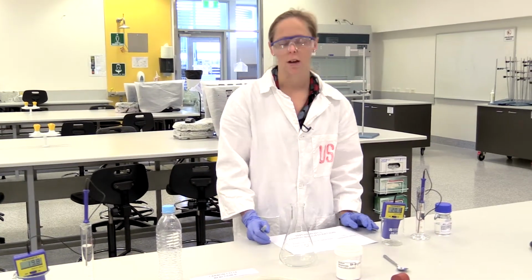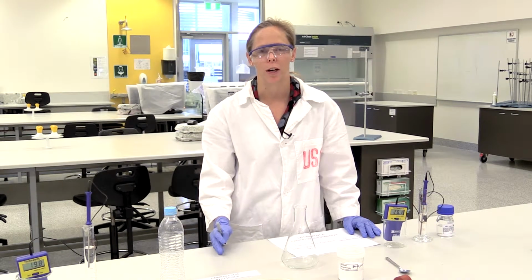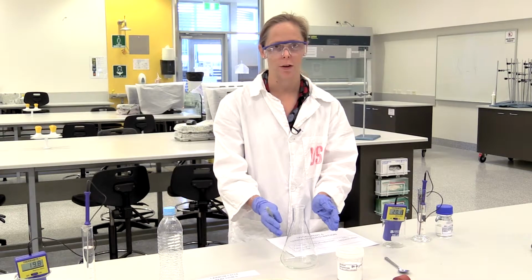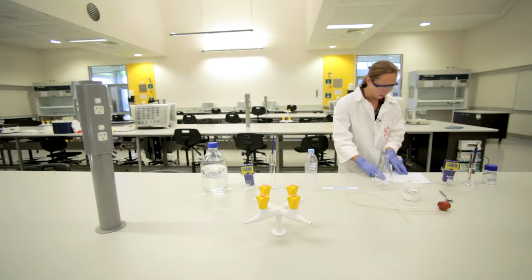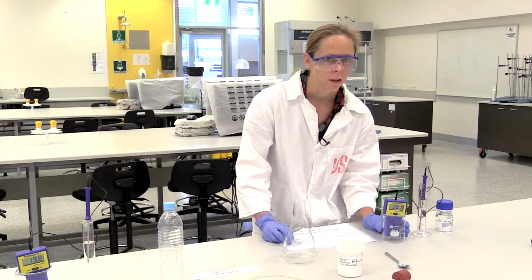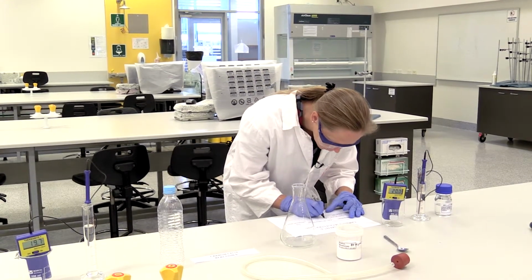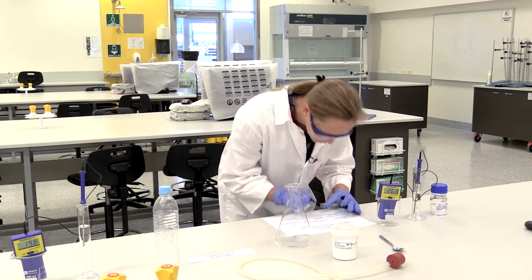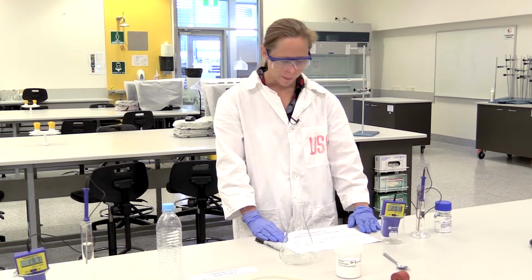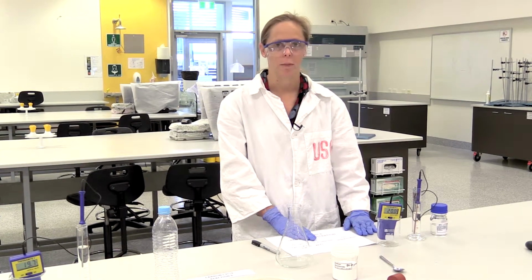So what we're looking for this time is to see if we get an increase in temperature or a decrease in temperature in each reaction. So this reaction here is going to be our carbon dioxide production reaction. So we need to read off the initial temperature, which is 20.1 degrees Celsius. So 20.1 degrees Celsius is our initial temperature for our carbon dioxide production reaction.